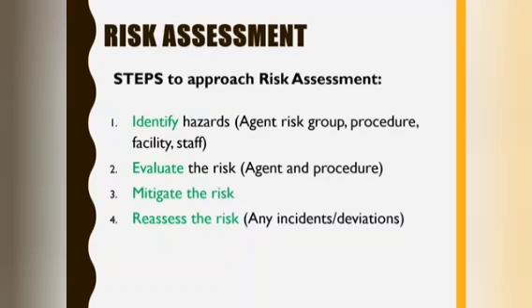Steps to approach risk assessment. 1. Identify the hazards: agent risk group, procedure, facility, staff. 2. Evaluate the risk, agent and procedure. 3. Mitigate the risk. 4. Reassess the risk for any incidents or deviations.